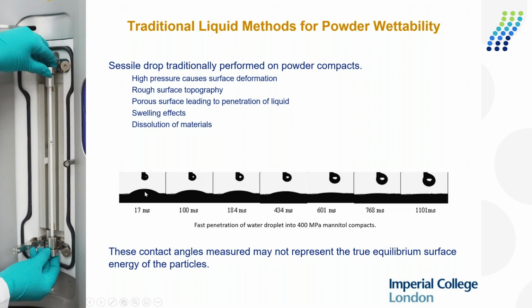On top of that, as well as the fact that the water goes inside the powder bed, we've got risks around swelling and dissolution, all complicated. So actually, we're not going to do anything too much involving powders in terms of wettability, but we're going to use a different technique for that.